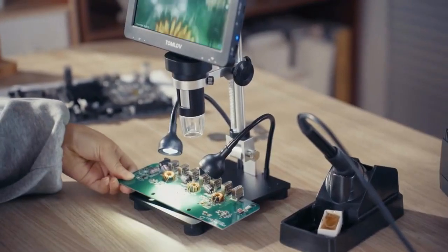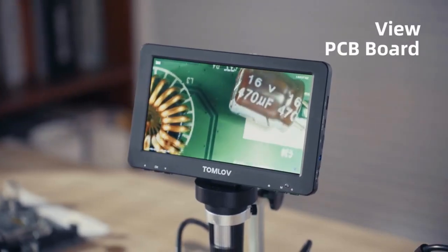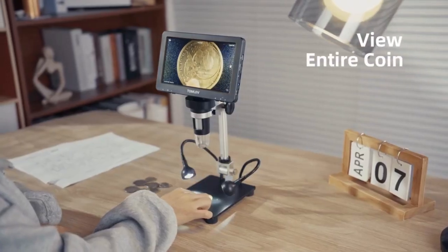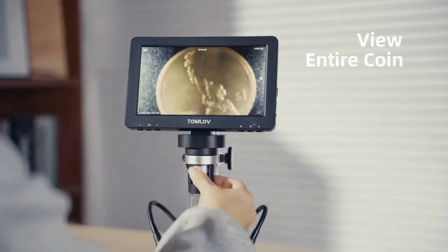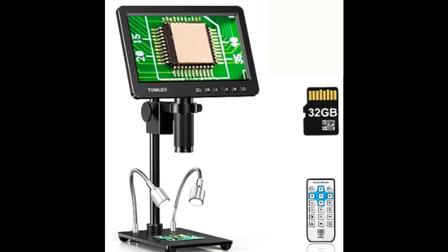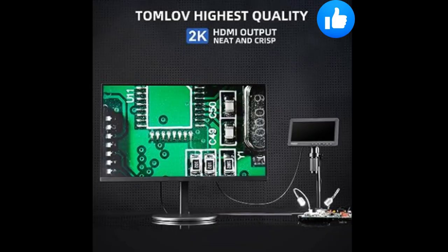So there you have it, the Tomlov DM209 2K HDMI digital microscope, a game changer in the world of microscopy. From its remarkable image quality powered by the Sony CMOS IMX sensor to its versatile connectivity options and user-friendly features, this microscope truly takes your exploration to the next level. If you're ready to unveil the hidden world in stunning detail, the DM209 might just be your perfect companion.